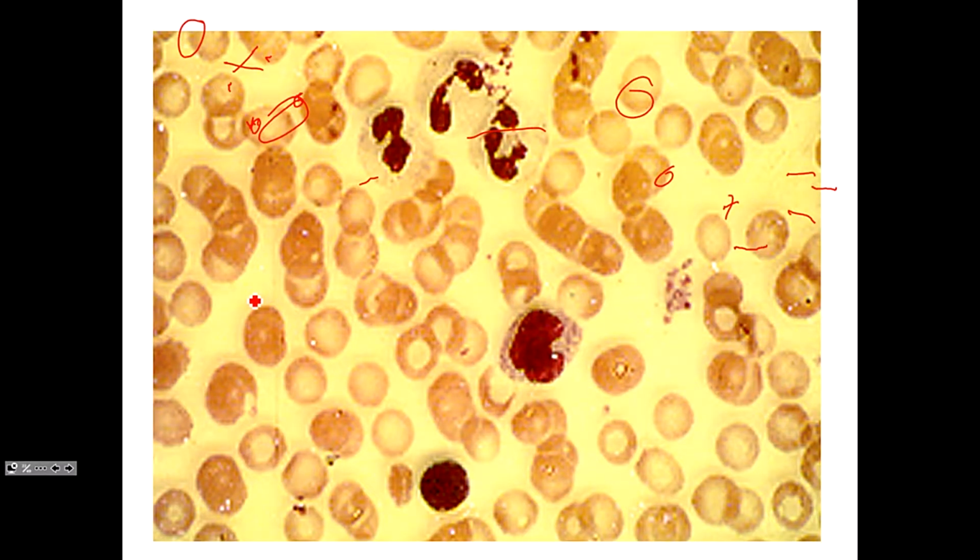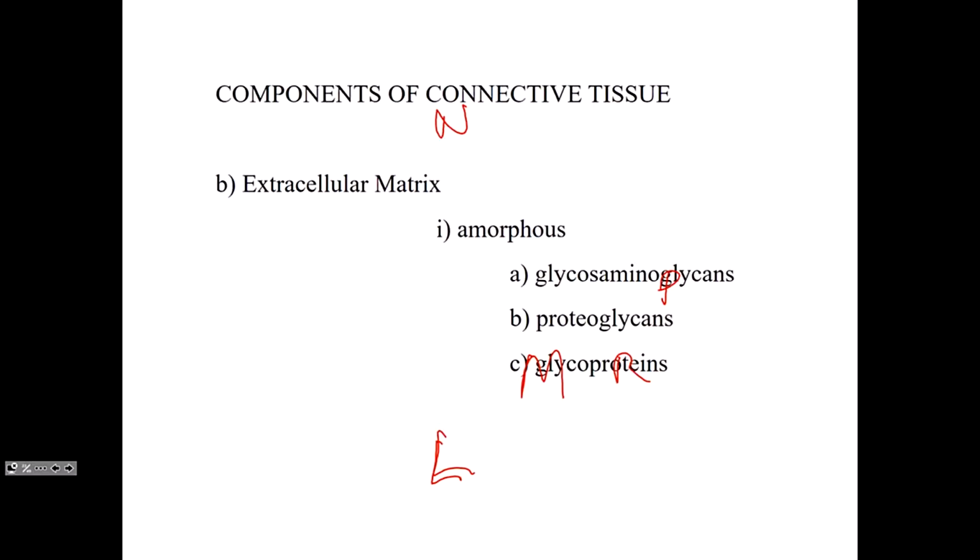So here are some of these cell types that we just looked at. Most of what you see there are the red blood cells that don't have a nucleus. We can see a lymphocyte here, a monocyte here, and these are neutrophils up here. And these are platelets, and of course these are red blood cells. Okay, so that's the cellular components and the functions of the cellular components.